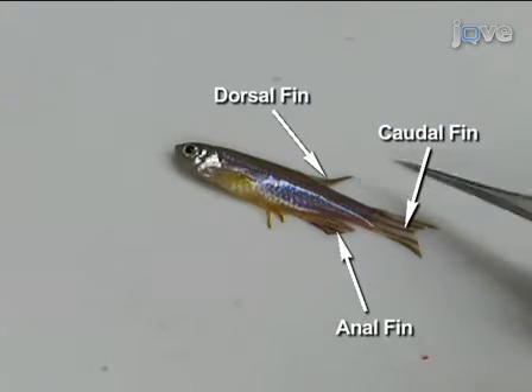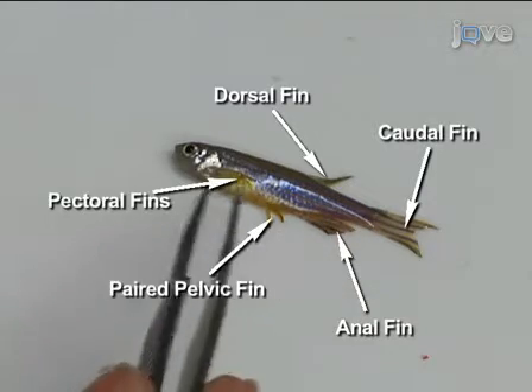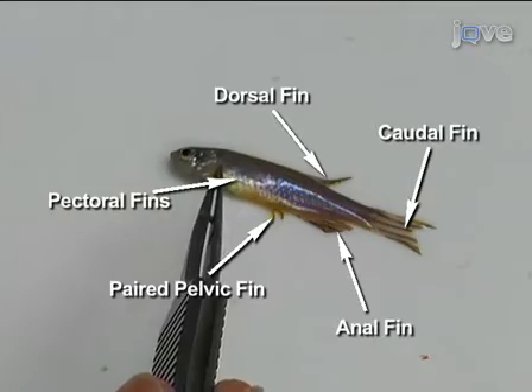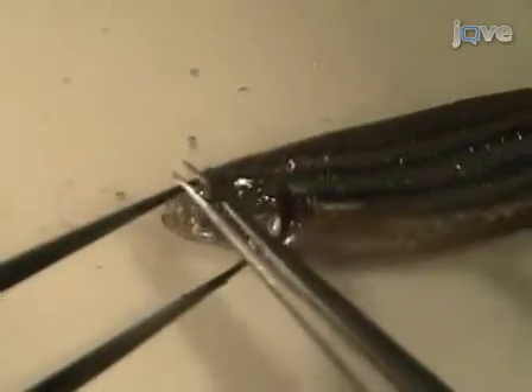Zebrafish have single dorsal, caudal, and anal fins and paired pelvic and pectoral fins. Use dissecting pins to pin the fish to the dissecting mat through the fleshy part of the tail and the ventral part of the eye socket.